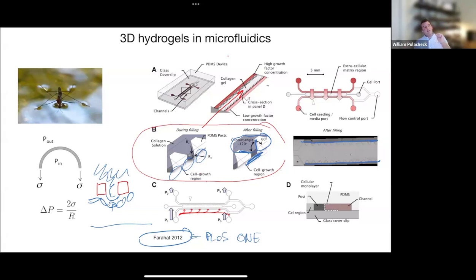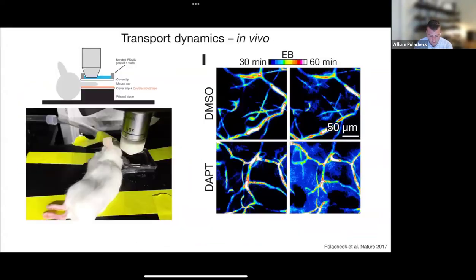As long as you have a hydrogel that does not significantly swell, or if you have design features to account for the swelling, then indeed you can control pore size as you would with another hydrogel, for example, through cross-linking or other mechanisms. Thank you. Does that answer your question? Yes, thank you. Okay, cool.